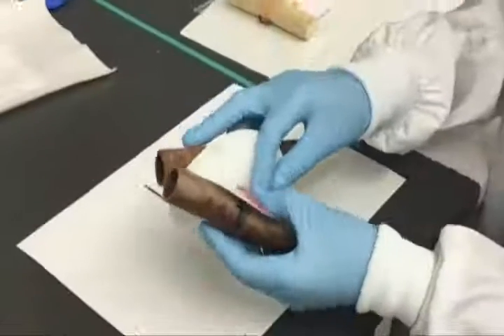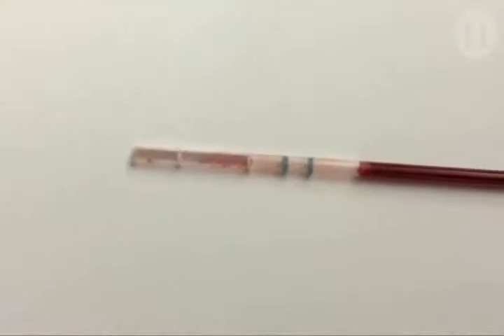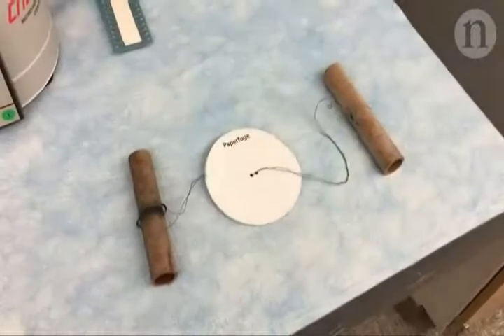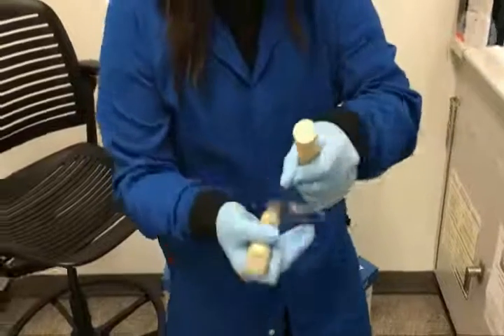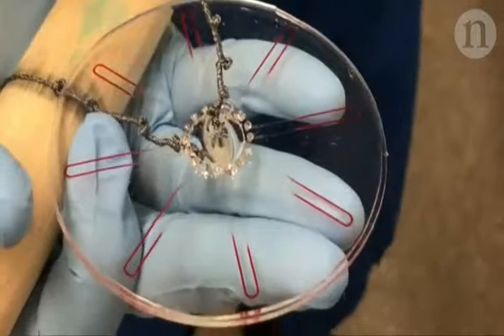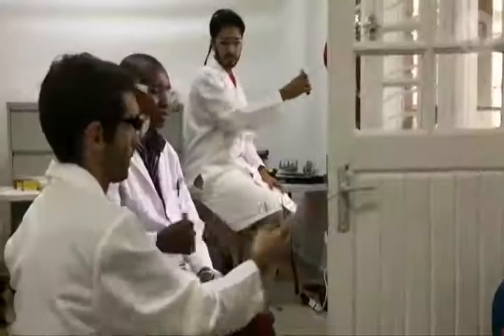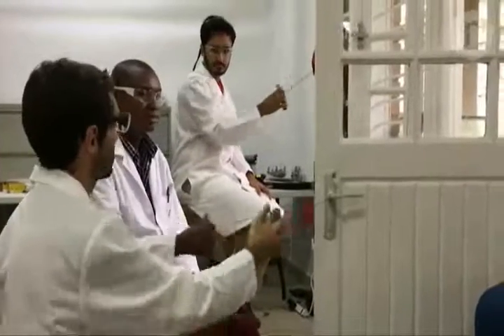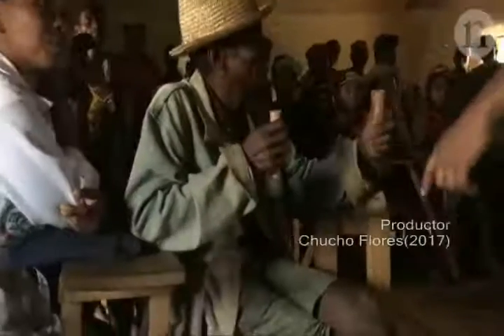A longer spin separates out the part of the blood needed for malaria testing. Named the paperfuge, this device costs just 20 cents to make out of paper, fishing wire and wood. Or you can 3D print plastic versions. Field testing in Madagascar showed just how easy it is to use the device, which means that even remote areas with no money or electricity would be able to use the paperfuge to perform basic but vital medical tests.